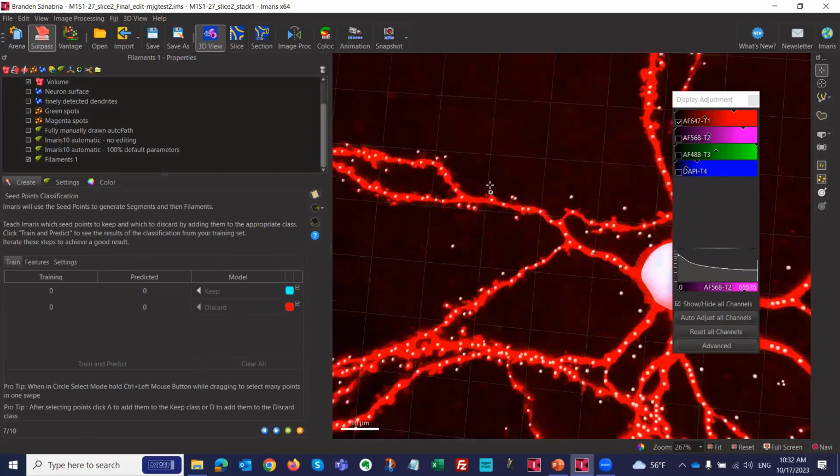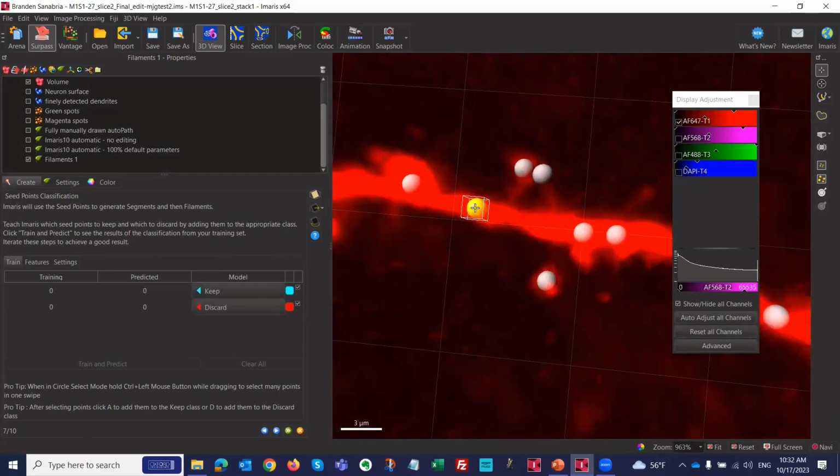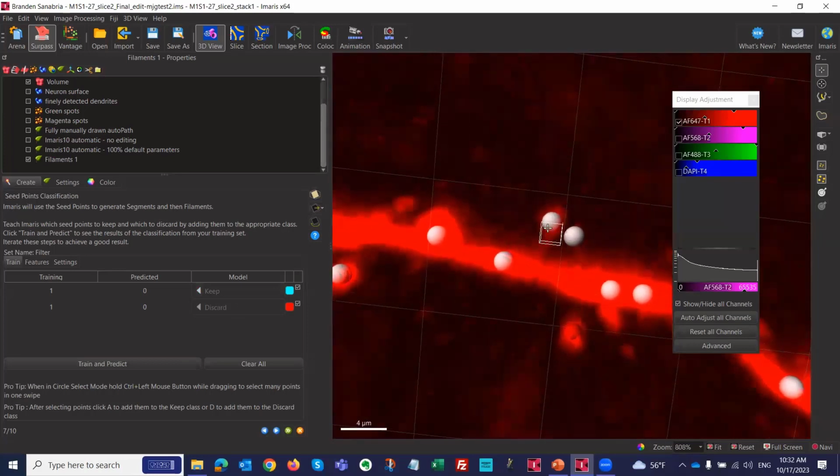Okay, so what you do is you go in here, you click this guy, you say keep, you click this guy, which is a spine, discard, this guy, spine, discard, this guy, discard, this guy, keep. You can see I have 2 or 3. And you want to do it for, obviously, as much as possible, but around 20, 25, maybe 30. And then the rest, we click train and predict and it does the rest for you.